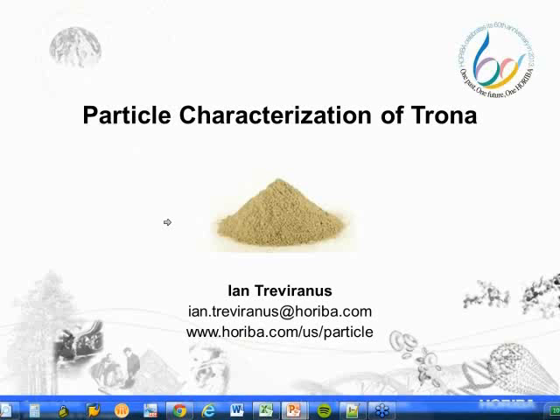Then I'll give some example data, and then what I'm going to do is show you how you can interpret those results correctly and also use the technologies we'll talk about today to help you screen incoming material or monitor anything that's coming off your mill.